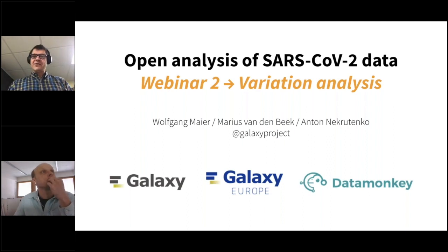Well, first of all, it allows you to validate assemblies, and we know that some of the GISAID assemblies are questionable. Also, it allows us to answer questions, for example, is there evidence for multiple infections? Is there evidence that there are multiple infection sites, for example, upper respiratory tract, lower respiratory tract, things like that. It also allows us to correlate sites which are changing with the sites that we predict as being under positive selection.